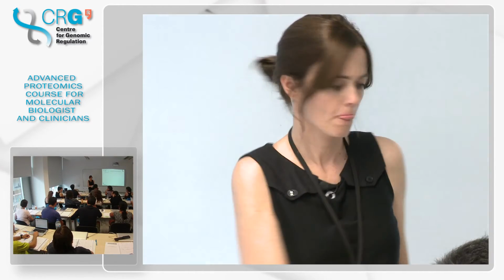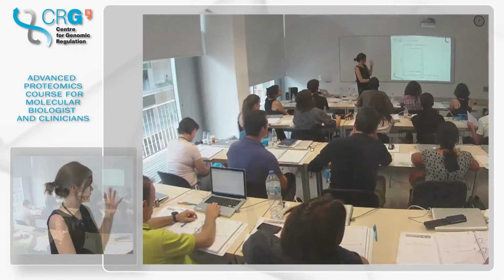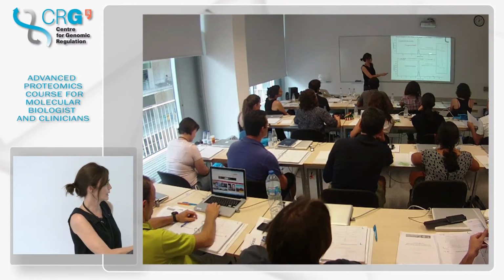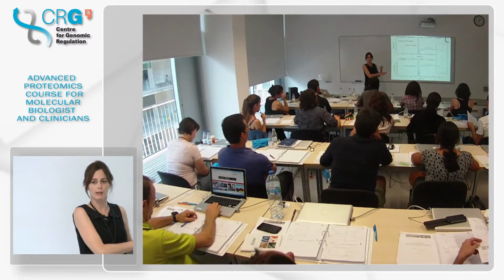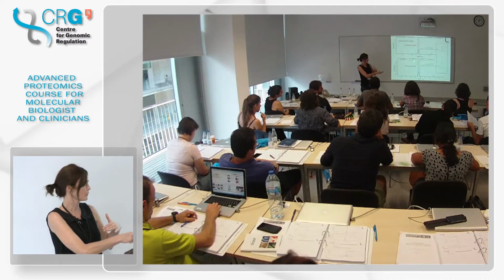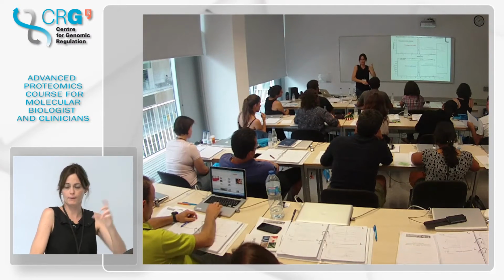This summary that you said, can you repeat again? Yeah, this is important because sometimes this is equivalent to this. This is a view that helps you see each one of the transitions and helps you compare, for example, the ranking of transitions between the heavy and the light.